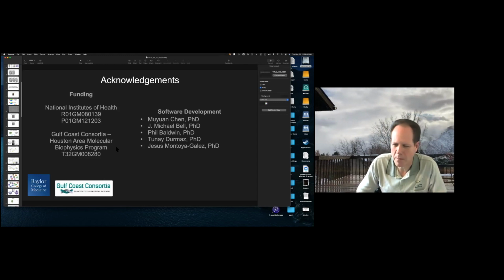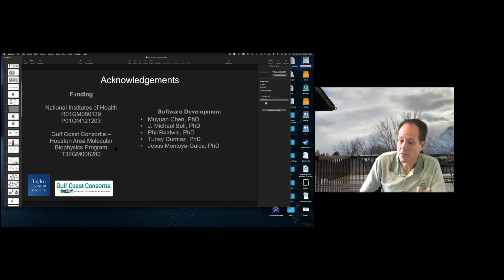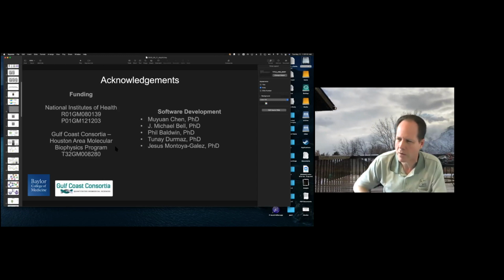The GMM applied to tomography, it's kind of working now, I'm told. I haven't played with it myself yet. Muyuan's been working on it really heavily recently. I'm guessing probably over the next 2 or 3 months we may have that in sort of a form where it's fit to be used. Right now, if you download a snapshot version instead of the stable release, you could probably play with it, but I probably wouldn't with the GMM stuff yet. It's really not there yet. I mean, for tomography. For single particle, we're also improving it, but there was something that was at least usable in the release for single particle.